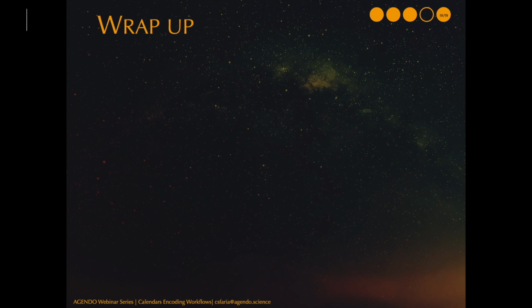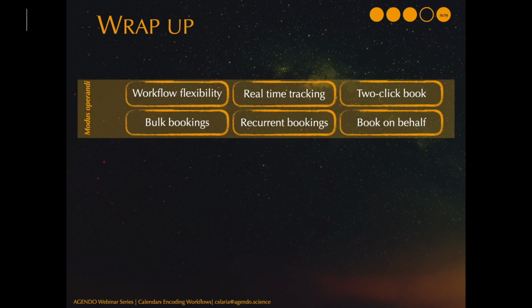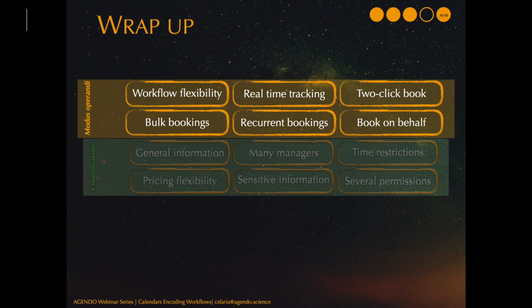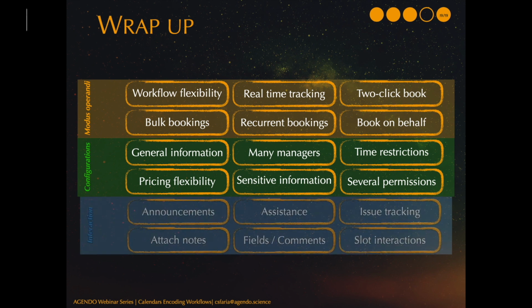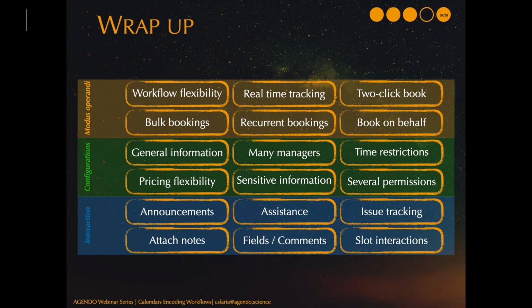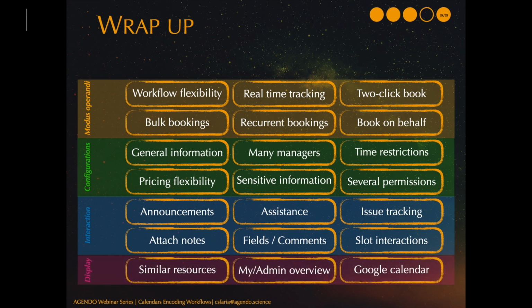Using Agendo, I hope you could learn about some strategies that could be used to address some of the most common situations and understand the way calendars can encode your workflow by setting it to regular reservation, pre-reservation with admin confirmation, with real-time tracking, blocked or hidden, the simplicity of the act of making a reservation and many other useful features, the configurability of almost every process and permission flexibility, which can always be further developed to suit your needs, the booking management and interactions between manager-user and user-user so that users can also handle their bookings without the manager intervention according to pre-established rules, and the clean and responsive overview of all bookings.